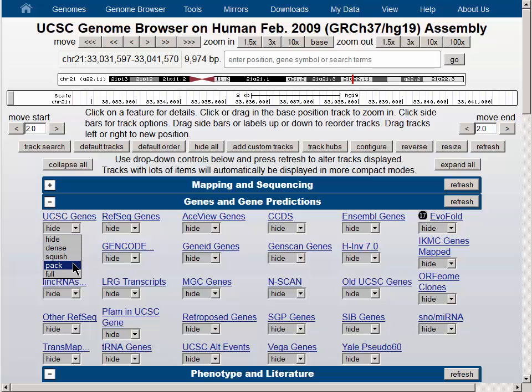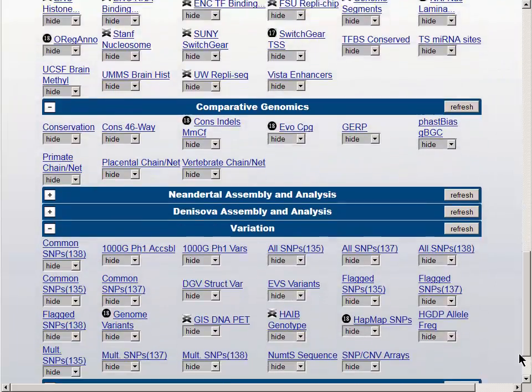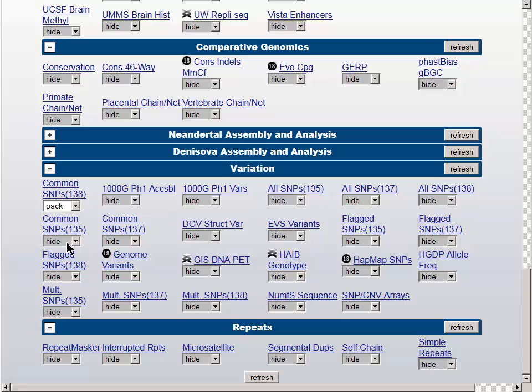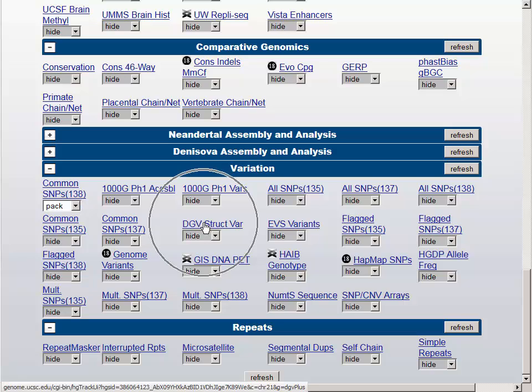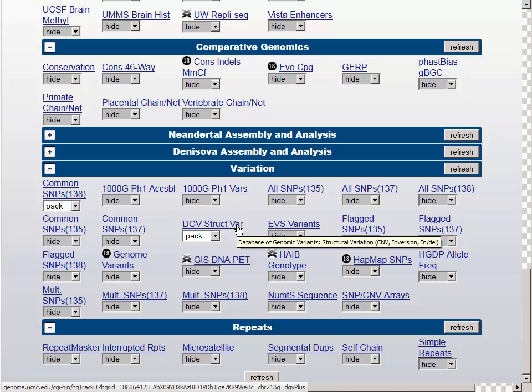Let's turn on the UCSC Genes track to pack. Scrolling down to the bottom of the track controls, we can turn on a couple more tracks in the variation group, specifically the Common SNPs track from dbSNP version 138, currently the most recent version, and Database of Genomic Variants Structural Variants — we'll turn them both to pack. You'll notice while we were here, you can put the mouse over the title and get the longer version of the title.